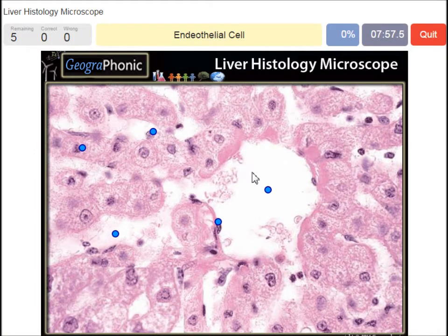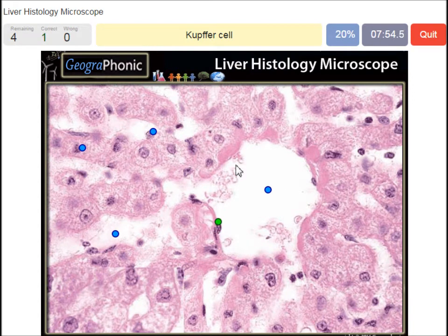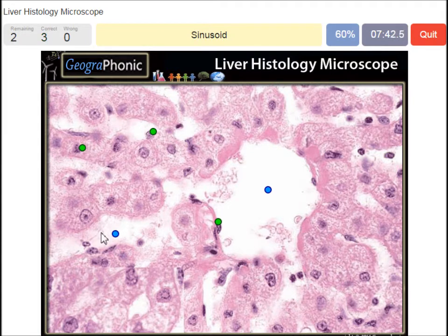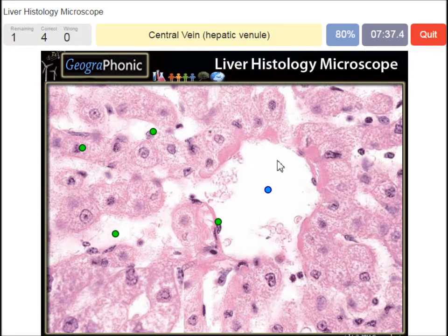An endothelial cell — that's this one. A Kupffer cell — that's this one, near the sinusoid. A parenchymal cell. A sinusoid, here this white area. And a central vein is of course a large white area. Hepatic vein.